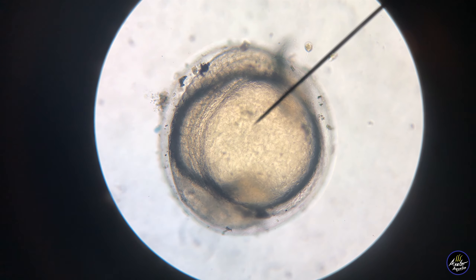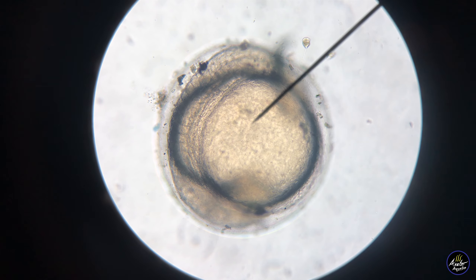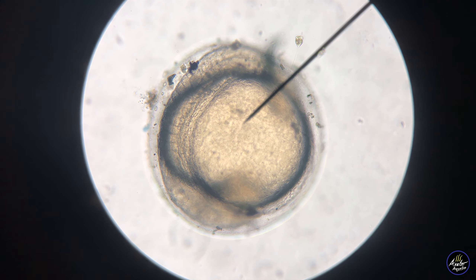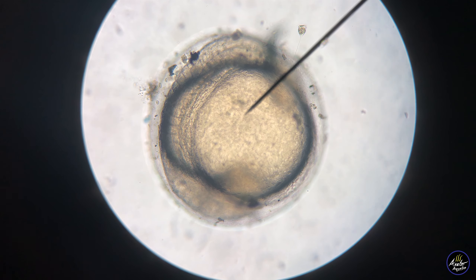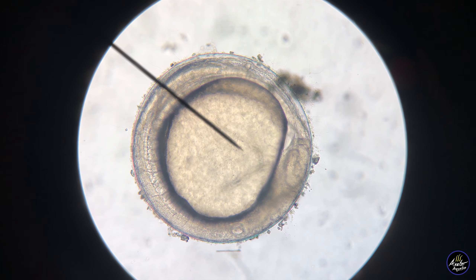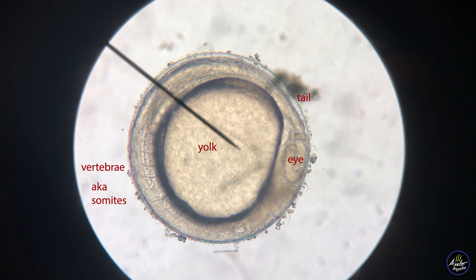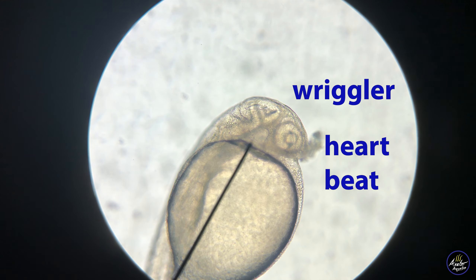Welcome to the science nerd slash microscopy section of this video. At a hundred times magnification we can see the head of the embryo wrap around its yolk sac in a very tight circle. Even in a tiny organism this small, not even born yet, we can see so much structure. There's the yolk sac, and look at the way its body is segmented — those segments are going to become vertebrae, what we call somites in biology. This is a side view: take a look to see if you can see the head, the eyes, the body, and the tail before I put the labels in. I'm so amazed at the amount of things going on and the amount of things that have to go right for an egg to hatch into a wiggler. And look at its heartbeat — how fascinating is that?